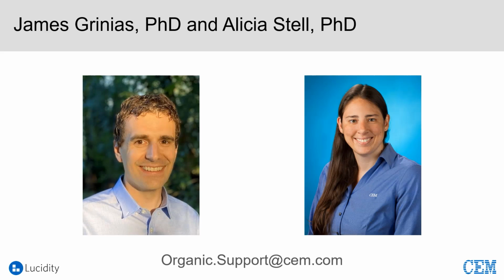Okay, and joining us for the question and answer session today is Dr. Alicia Stell with CEM and Lucidity. So I'll just go ahead and dive right into our first question. So the first question is, how might the method transfer process be different for gradient methods?